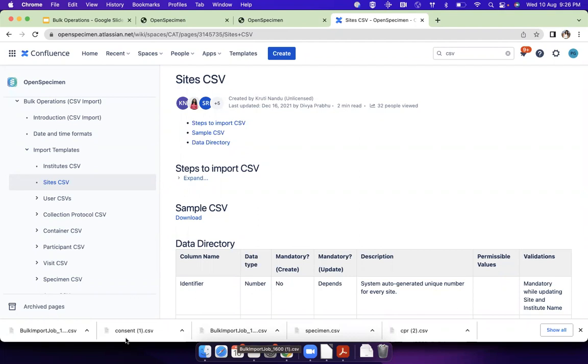There is a question: have you added the ability, through the UI, to bulk edit a list of specimens to allow for different values for each specimen, for instance concentration? No, right now that's not possible, but yes, a couple of users have asked for this. When we do bulk edit, right now it applies the same value for all the specimens. A table view is available right now for events. Edit events is there, where you can do a table view. Right now that's not there for the normal fields. Yeah, we can think about supporting a similar one for the normal fields.